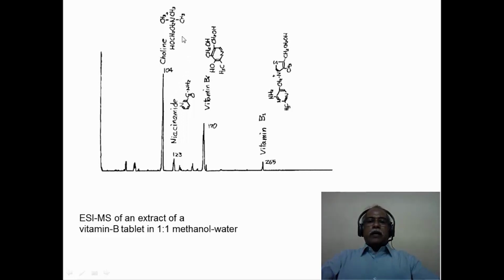For example, this is basically an ammonium salt, and it is non-volatile in nature. It is a high melting solid, and as a result of that, it is not possible to bring it into the gas phase in an impact ionization mass spectrometer. However, in an electrospray ionization mass spectrometer, because it is going through a solution phase and then the ions are getting evaporated, it is easy to detect them in mass spectrometry conditions.